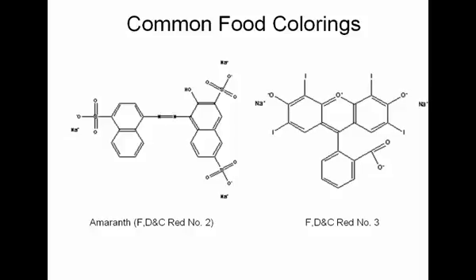And also we'll be dyeing fabric strips. We'll be making a diazo dye and using some different dyes to dye fabric strips, where it basically is a piece of cloth that has cotton in one band and rayon and wool and silk and different nylons, so that you can see the intermolecular forces that have to go on when you put a dye on a shirt, or on a piece of clothing.